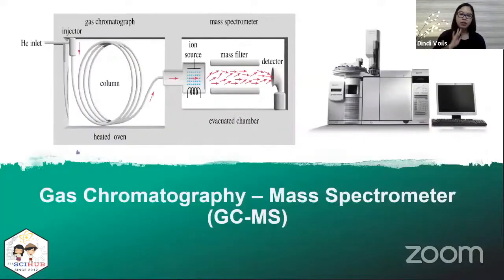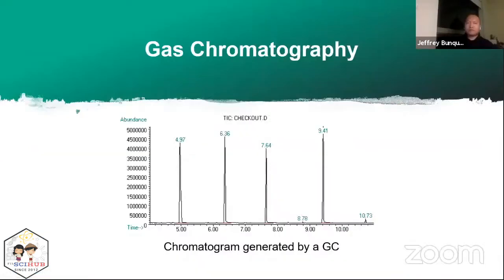On the other hand, GC-MS, we already talked about this, but same concept. The analytes that are being measured get introduced to a mass spec, and the analyte gets converted into ions, normally using electron ionization methods, and then the ions are sorted out using a mass filter and then get detected.